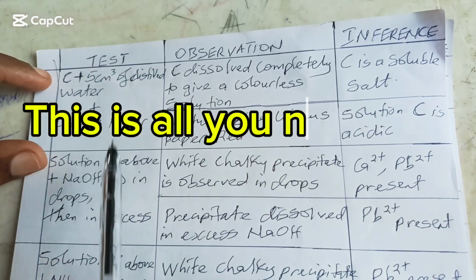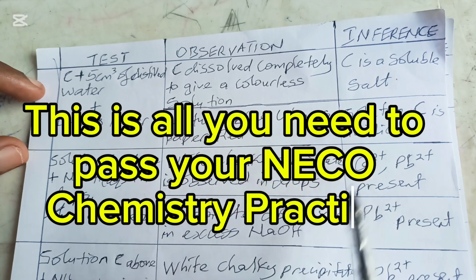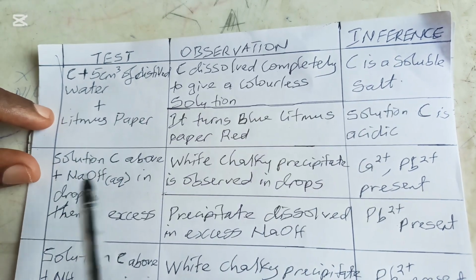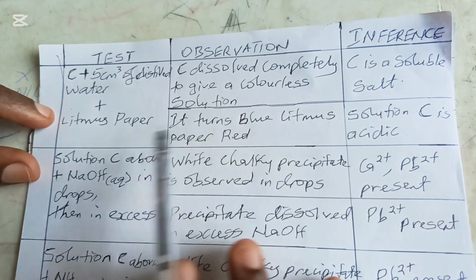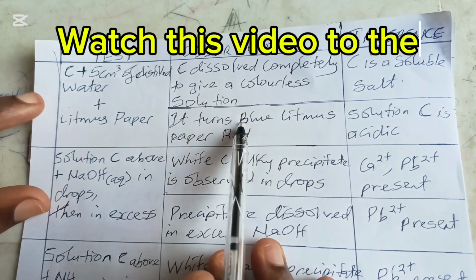Now, these are the expected questions and answers for your NECO 2025 chemistry practical. Salt analysis to be precise. I will make another video on the titration also. This is the salt analysis, okay?